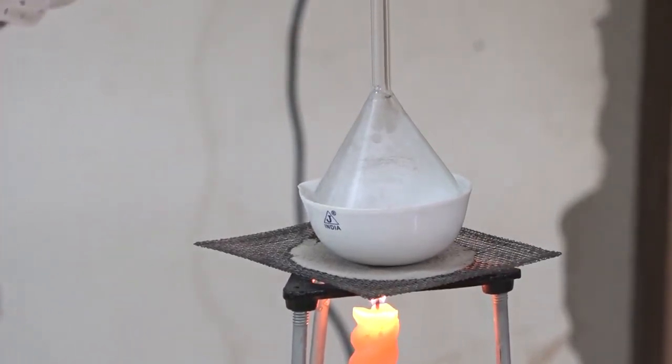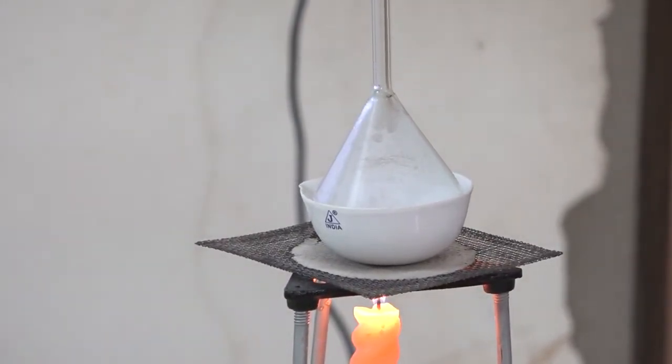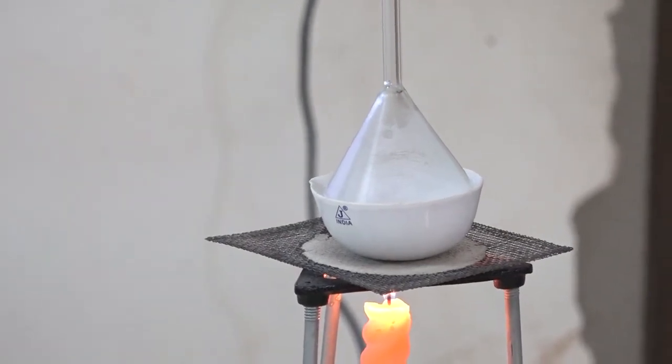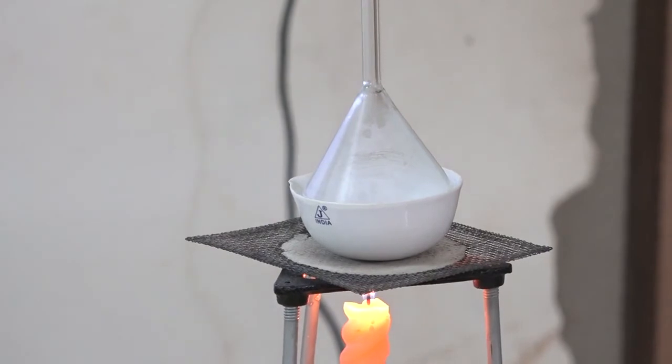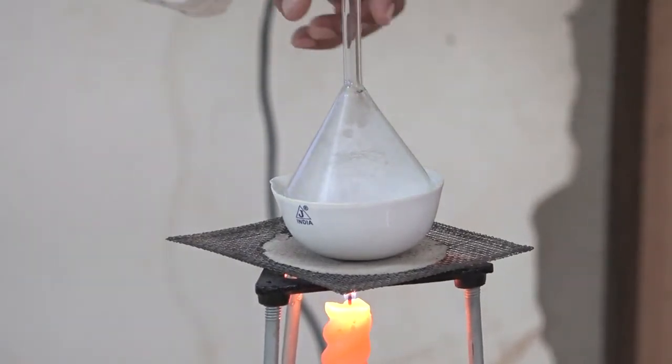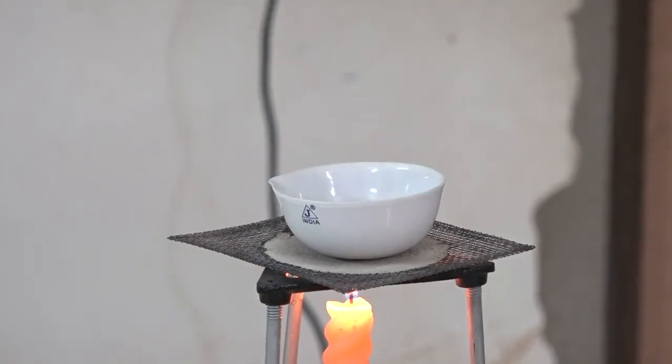See, on the wall of this funnel, some vapors are going to be visible. Some vapors are going to be gathered on the wall of the funnel. When we look, there are very few.